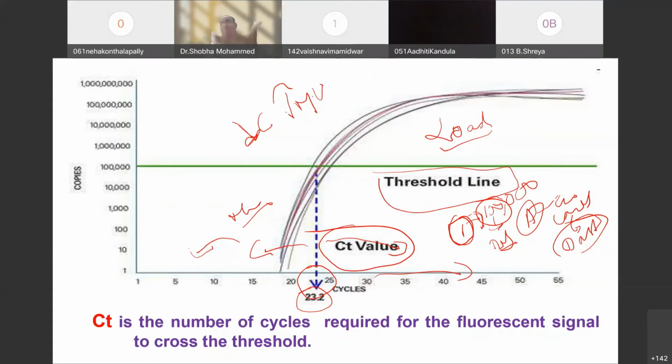Then the DNA will be replicated back to a formation of the DNA. And then it helps that it identifies it. What it is doing? It is doing an identification of that particular DNA which I am looking for with the help of the primers. So I don't know which primers are acting here. So I give random primers here. So any one of the primer will act on this and it gives me a new sequence of the DNA molecules of the COVID-19.